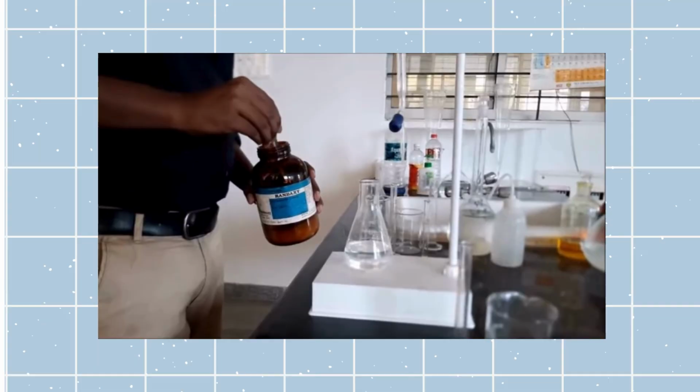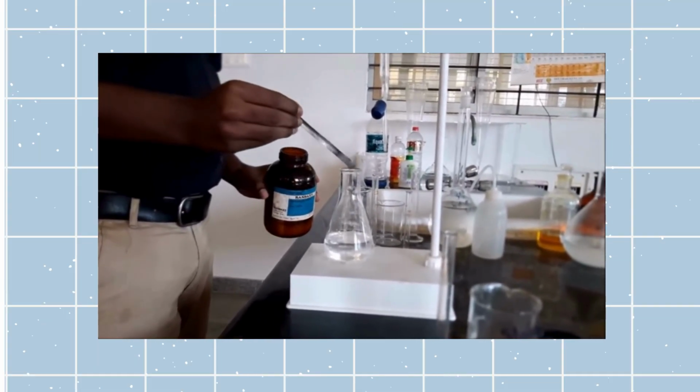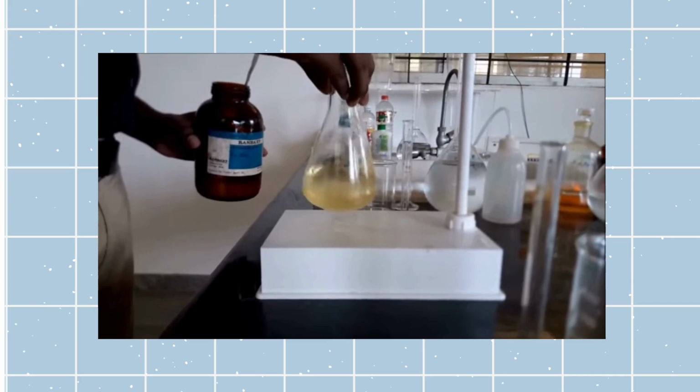A pinch of potassium iodide is taken and added to the sample. There's a slight change in the color. It has changed to a pale yellow color.